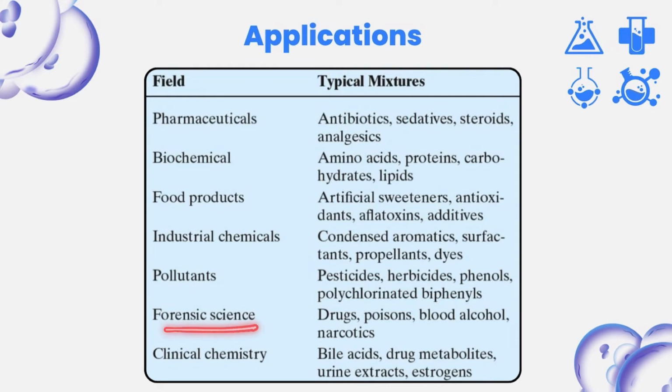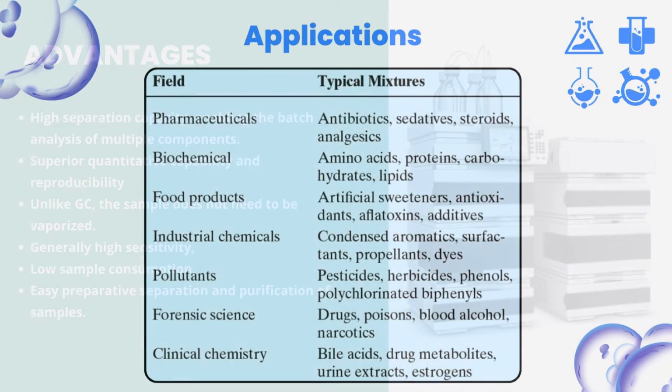It is used in forensic science for the analysis of drugs, poisons, blood, alcohol, narcotics. It is also used in clinical chemistry for information on bile acids, drug metabolites, urine extracts, estrogen hormones, etc.